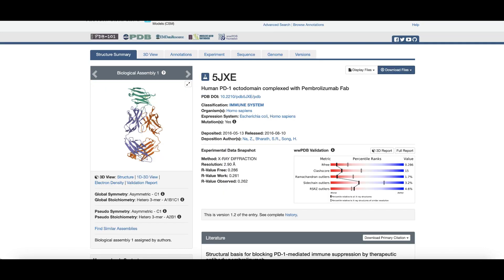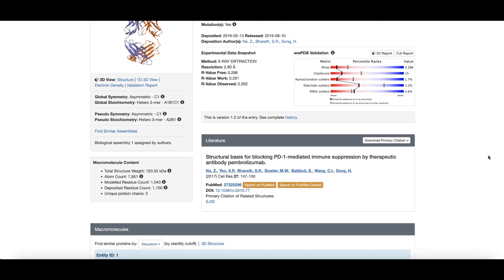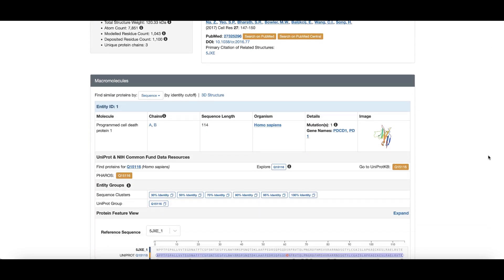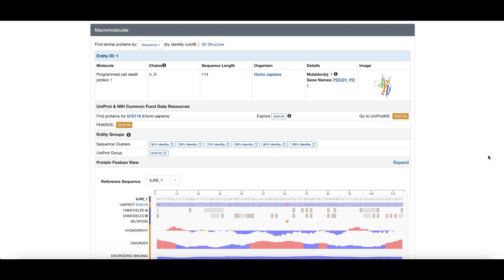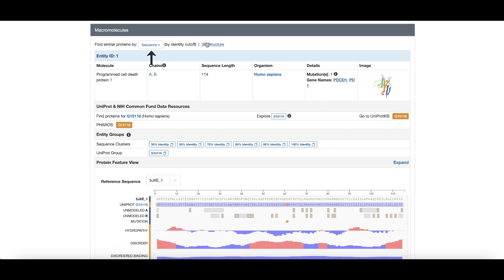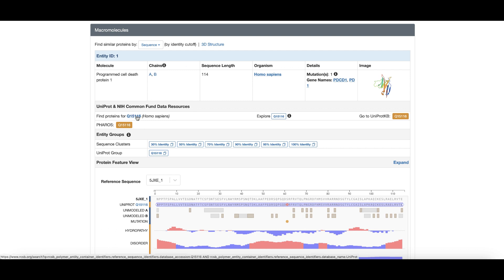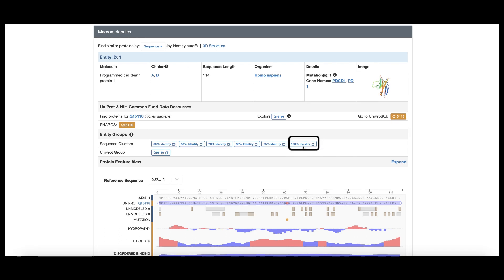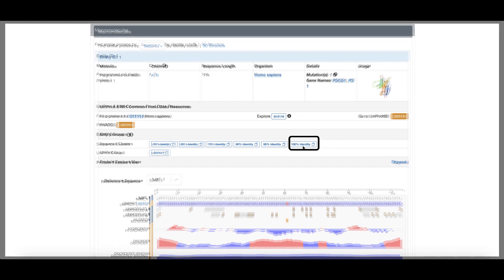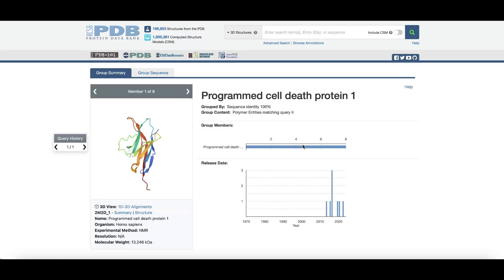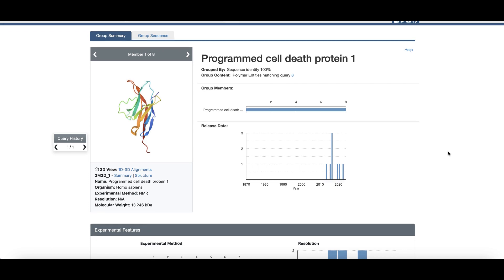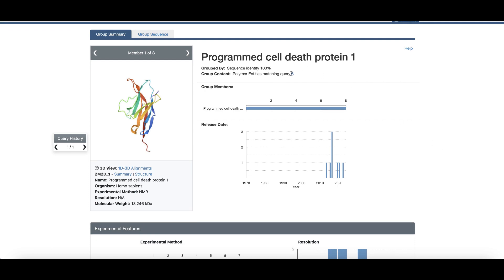In addition to presenting details about the structure, this page provides simplified options to search for PDB entries with similar sequences, 3D shapes, the same UniProt identifiers, and more. Click on this button to find other PDB structures that contain a protein with the same amino acid sequence as human PD-1 in this structure. The rcsb.org group summary page shows eight structures in this group.